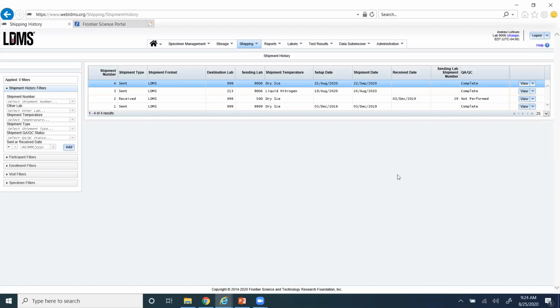Since we were using our boxes directly from storage, good and accurate storage really speeds up this process because QC speeds up, because you know everything that you check in those positions is correct, and so it means that you can sign off on QC a lot faster than if you're trying to rearrange the specimens to match what's on the screen. So we have our 3 steps: create a batch, QC the batch, create the shipping file and paperwork. Now, where does that shipping file and paperwork go?